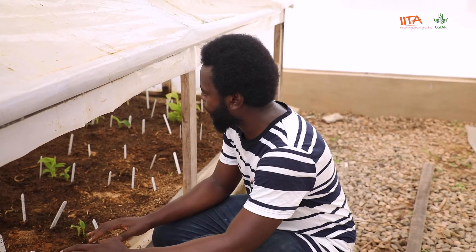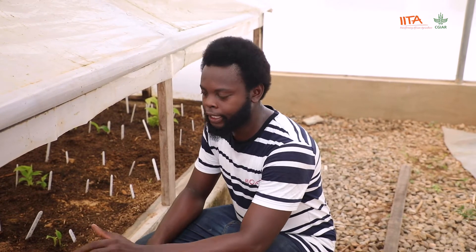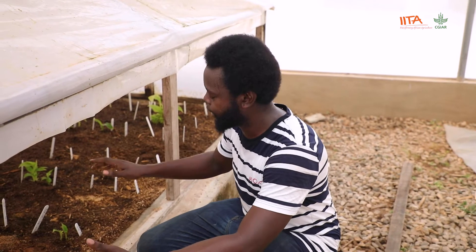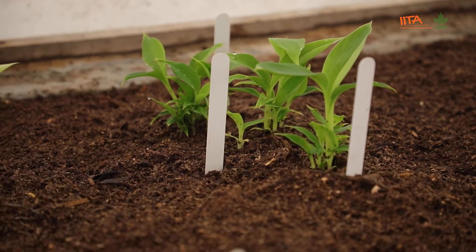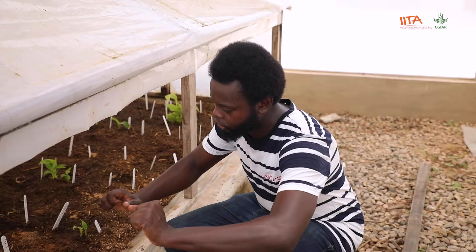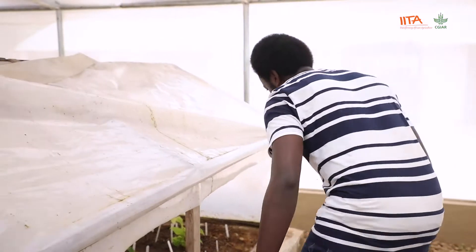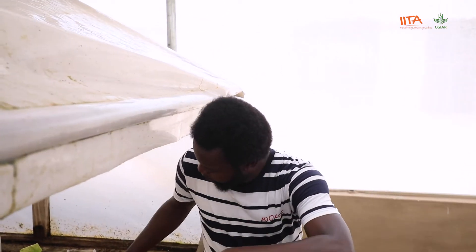This is a technology that helps farmers with less cost to produce a lot of healthy planting material. One of the most important things about these plantlets is that they grow at the same time — when you take them to the field there is an 80 percent guarantee that they will be harvested at the same time. Let me show you the process of growing and harvesting the plantlets — you can come closer.